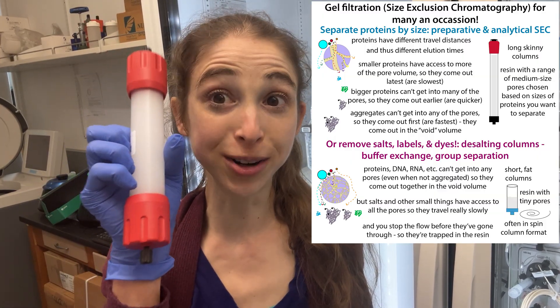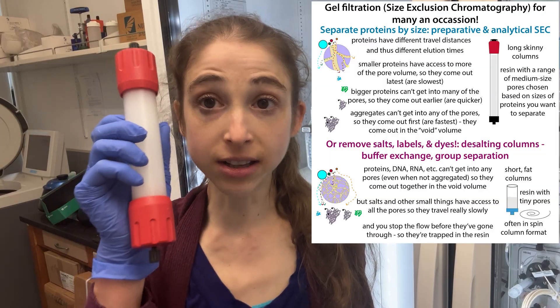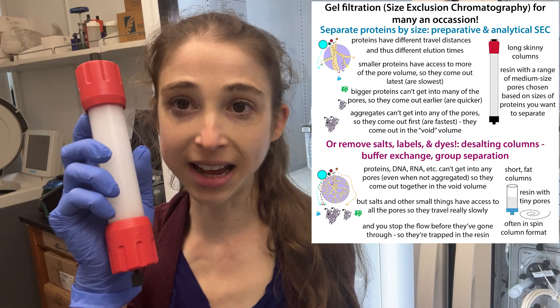I'm really excited because I finally got a desalting column — I've wanted these forever. This is a great alternative to dialysis, which I really hate, for removing small things like salts and dyes from a solution of proteins that contains those unwanted salts and dyes.